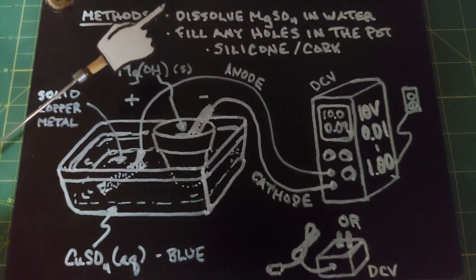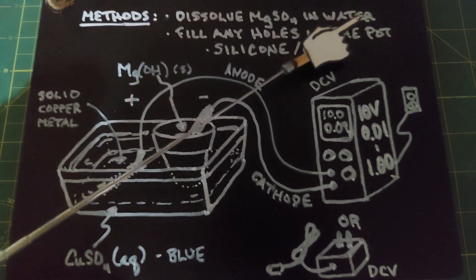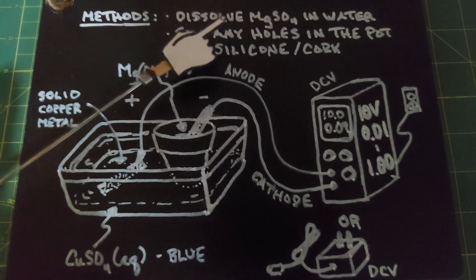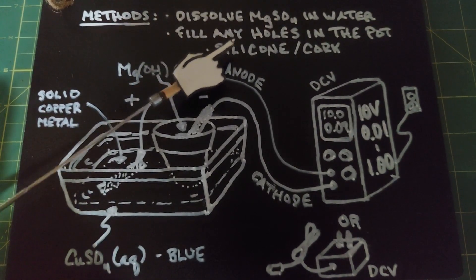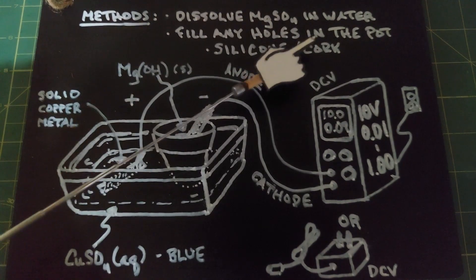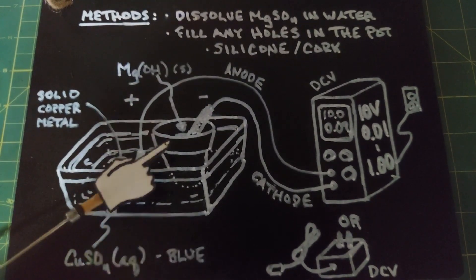For our methods, first dissolve 100 grams of magnesium sulfate in 600 milliliters of water. Then fill any holes in the pot — I filled mine with silicone, and I think it's going to work just fine. I've also seen corks used in different experiments. Just make sure that no solution can go in and out of your pot.